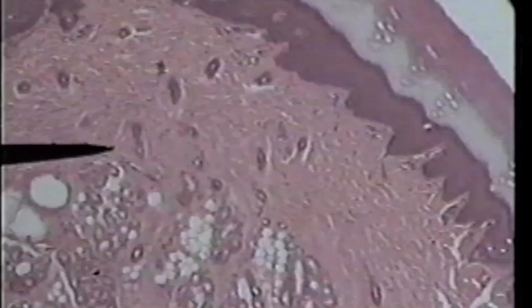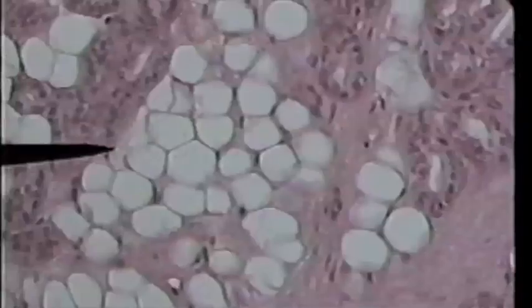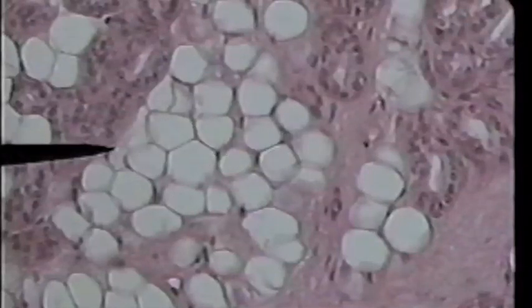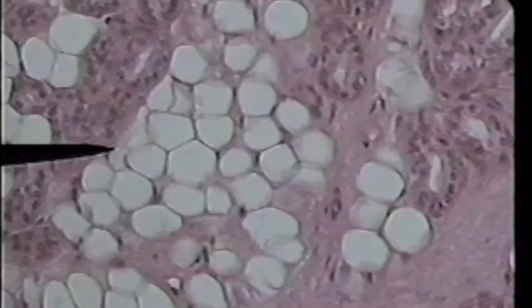You can just see them — they're pretty distinctive. The tip of the pointer here is on adipose cells found in the hypodermis, or the area under the skin. You can see that these cells are large cells that are storing fat. That's all an adipocyte is: a cell that's storing fat.